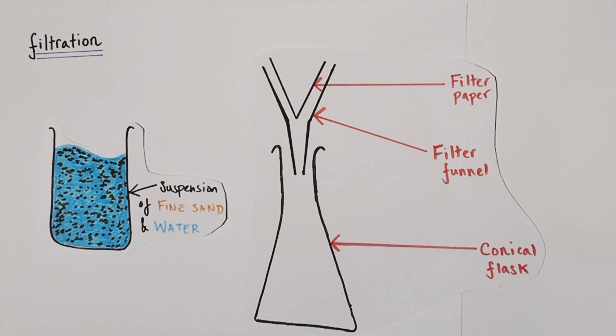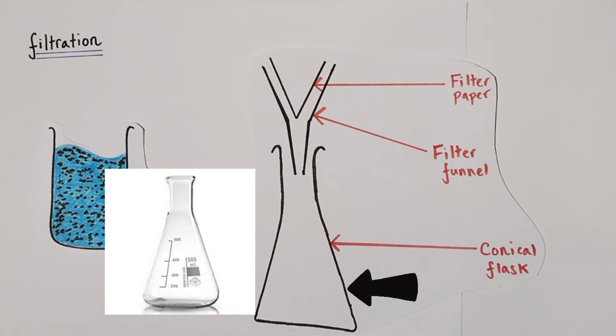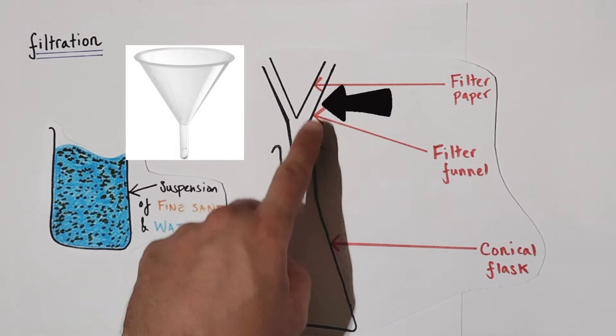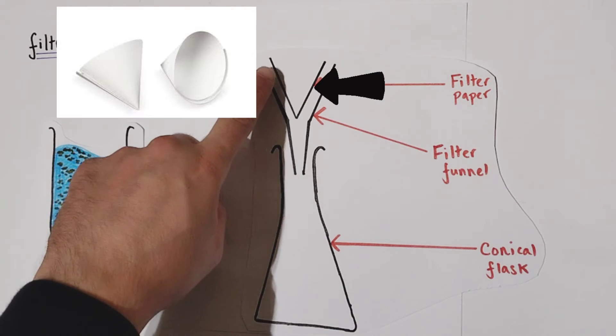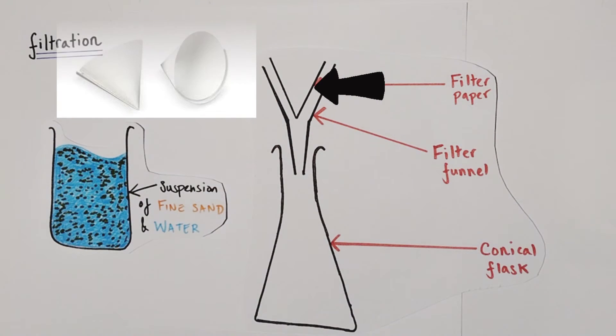Now I'll take you through a really basic filtration setup. Just three pieces of apparatus required. A conical flask to collect the liquid as it runs through the filter funnel and the filter paper. The filter funnel itself will sit in the conical flask and most importantly the filter paper then rests inside the filter funnel. You will probably have already dampened your filter paper so it sticks nicely to the filter funnel itself.